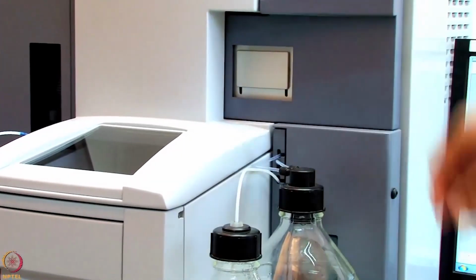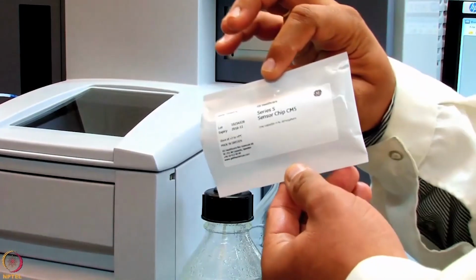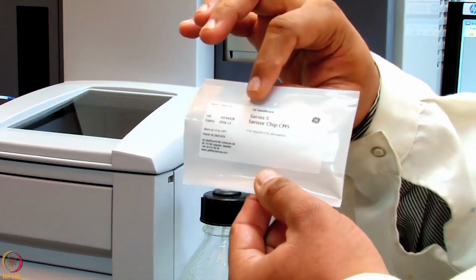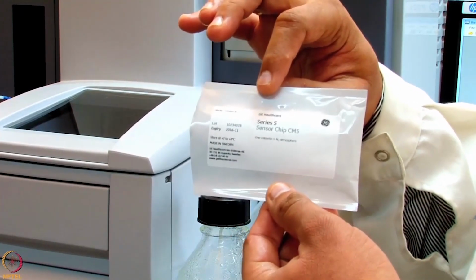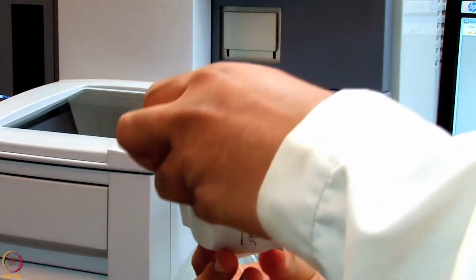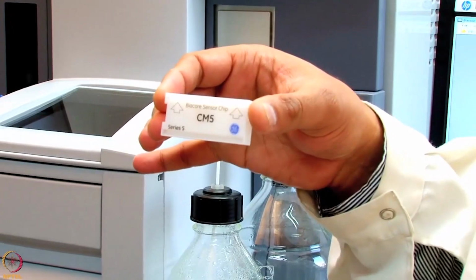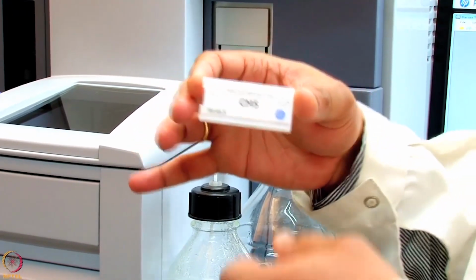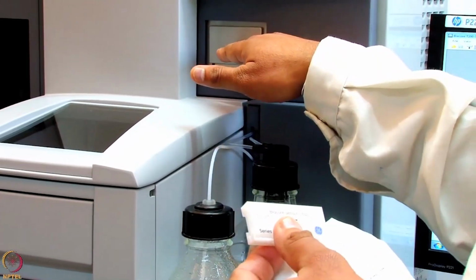So let us look at the chip now. This is a new chip. The chips are generally provided in these cassettes, and the new CM5 chip will look like this. This chip will be inserted in the chip docking area.